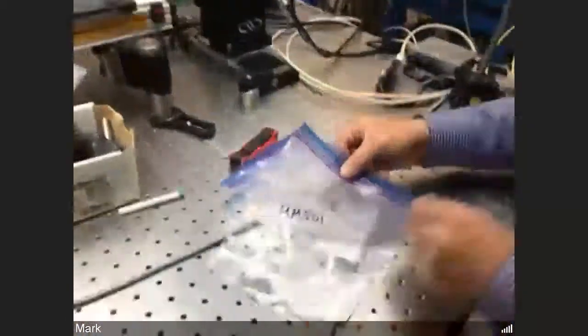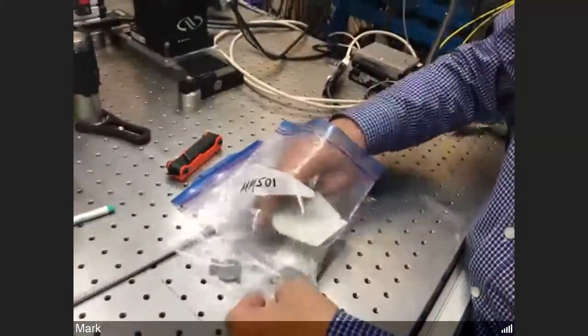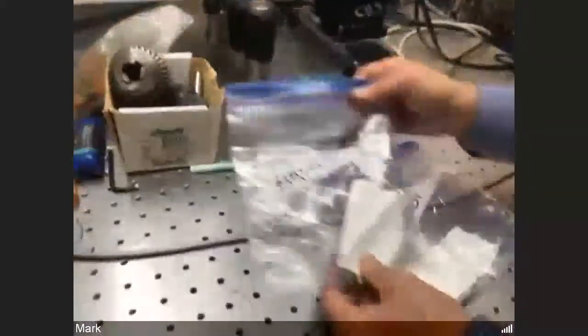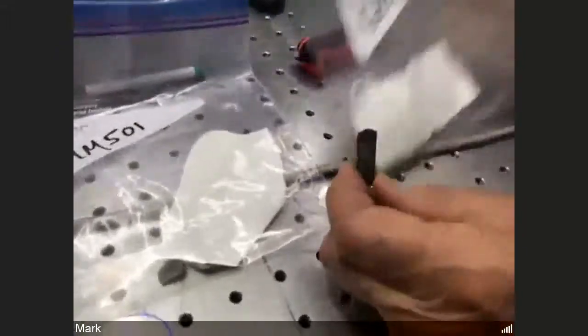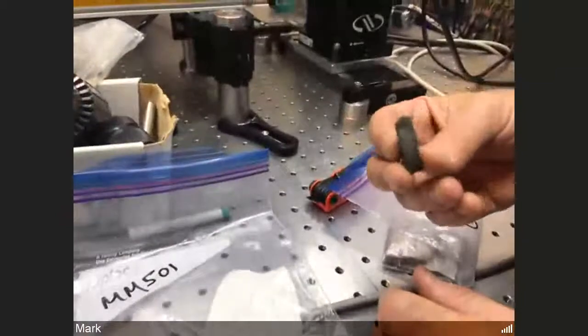So the samples that we're going to be measuring today, Doug will talk about when I get back to my office. But they're samples from the Chicxulub impact crater, Mexico, and from drill cores from that. They're irregular pieces of rock, and they don't really fit very well into a drill chuck.